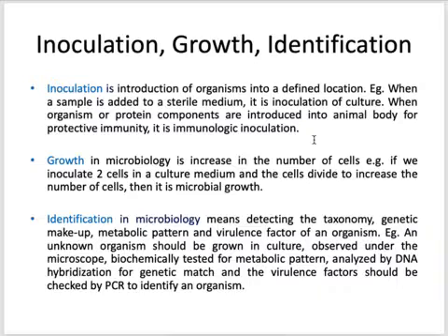So what does inoculation mean? For example, you have some bacteria, E. coli, and you have transferred some of the E. coli into a new media. That media can be solid media or liquid media. So you have some E. coli and you put that E. coli into that media. This is called inoculation.